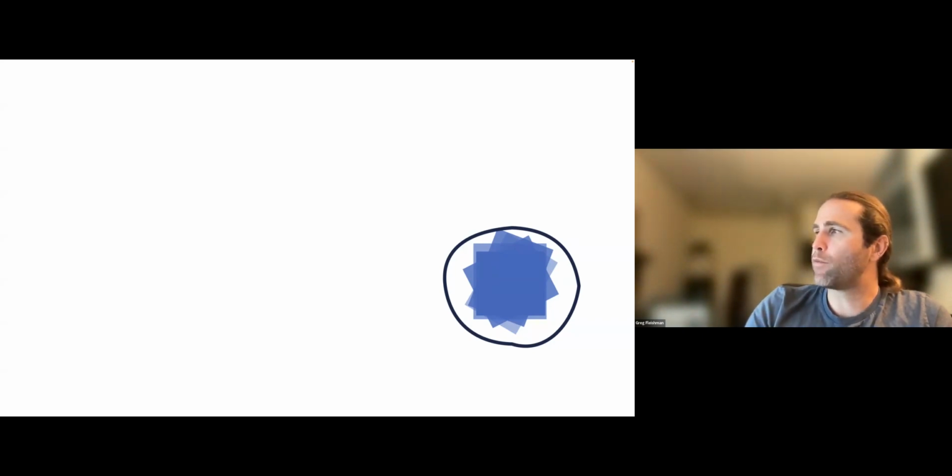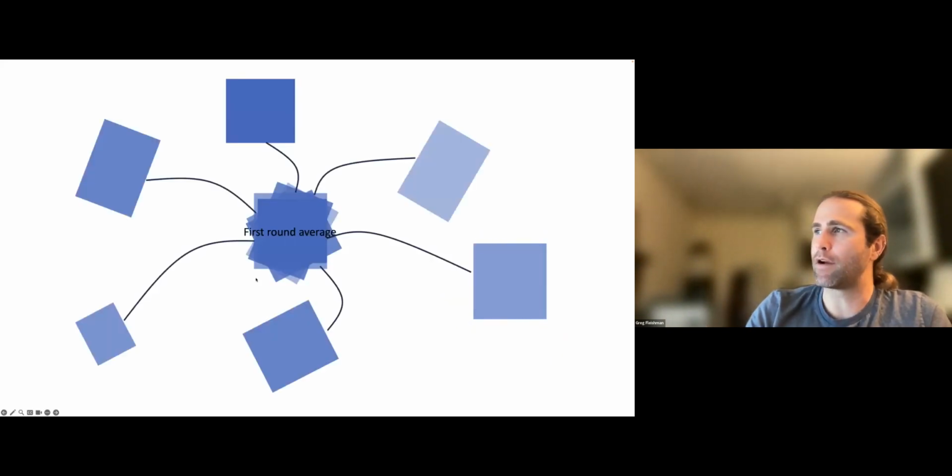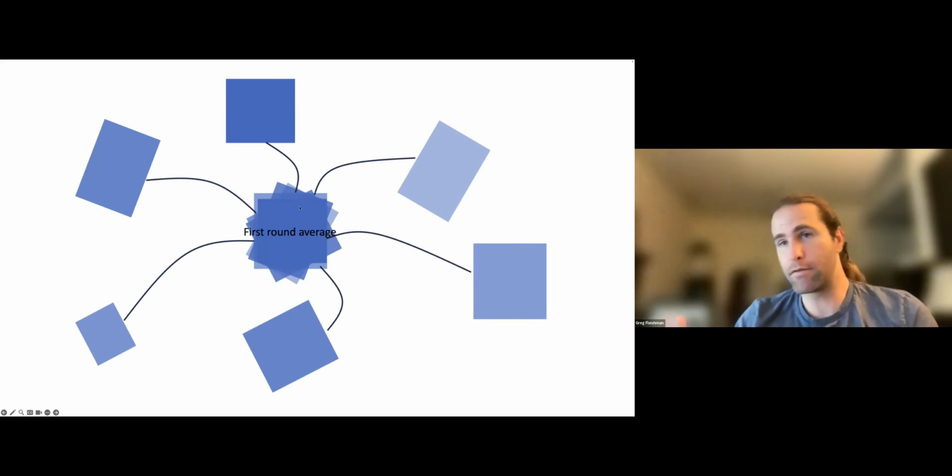So instead of doing that, we're going to take all of these resampled images that roughly match the initial target, and we're going to average them together. So now I've moved the average back to kind of the center of where the original images all were. And it looks messy because, like I said, we just averaged all of those images together. And their registrations were imperfect, and the shape of this initial template is biased to the shape of that one subject and all of the limitations I mentioned.